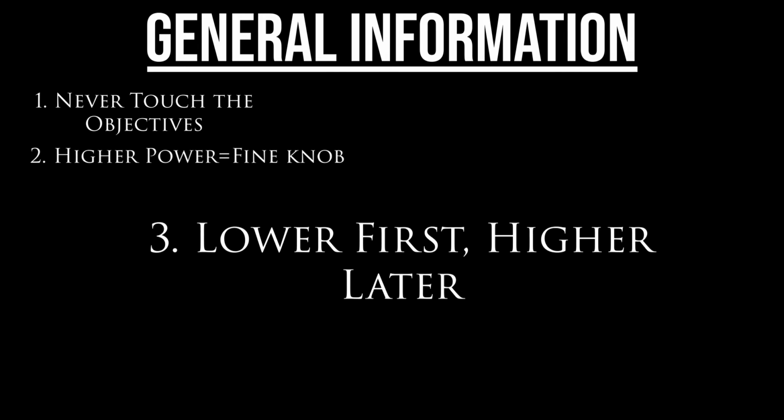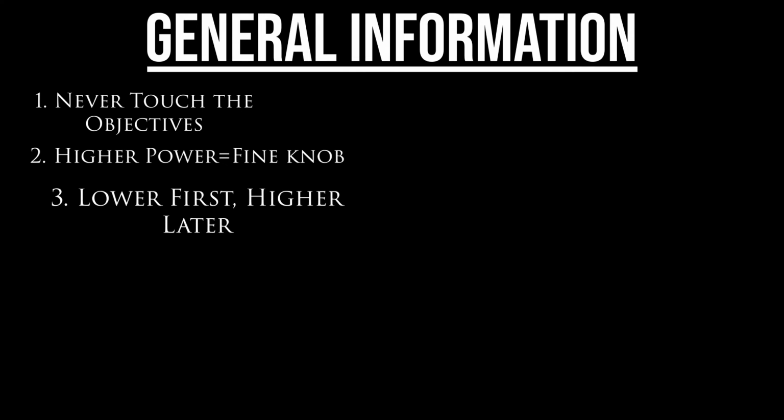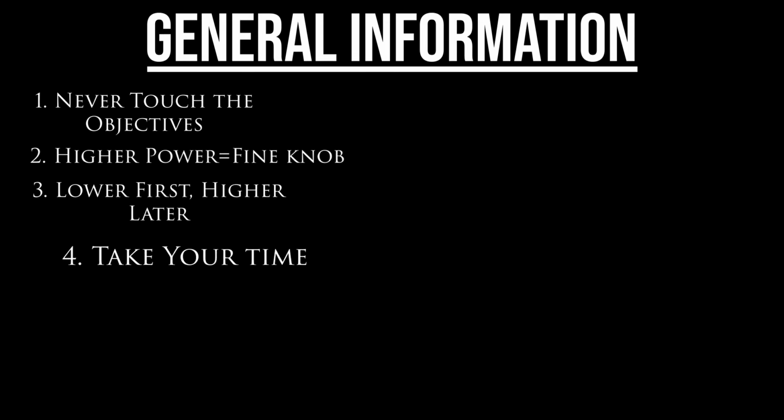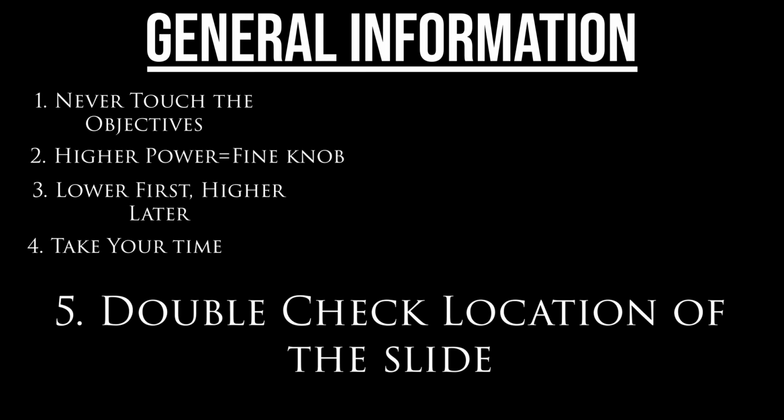Third, always focus on your sample with the lowest powered objectives before moving on to the higher powered objectives. Fourth, take your time. This can be a slow process, but taking your time earlier can save you a lot of frustration and time later on. Fifth, make sure that your slide is seated correctly on the stage. If it has not been properly secured, you will not be able to move the slide effectively.